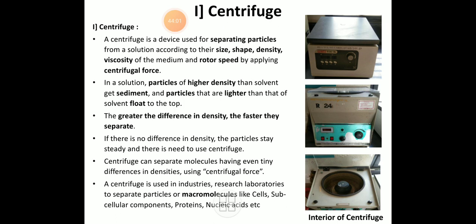My friends, again a most important instrument, that is the centrifuge. We know that we want to separate solids from the liquid, isn't it? Solid from liquid or solutes from the liquid. Then it is possible with the help of this one. A centrifuge is a device used for separating particles from the solution according to the size, shape, density, viscosity of the medium and the rotor speed by applying centrifugal force.